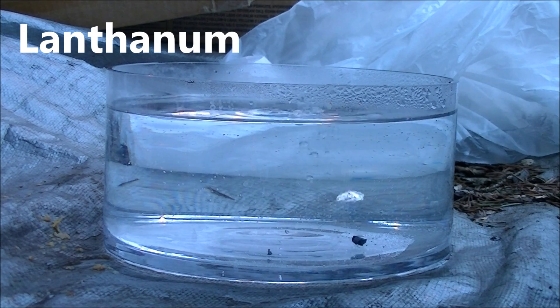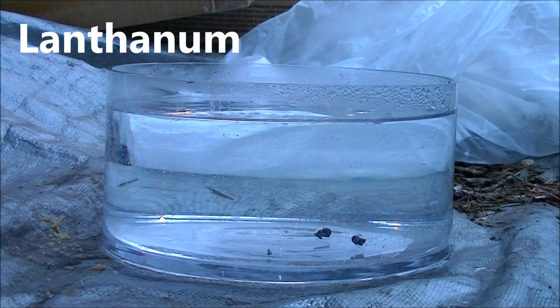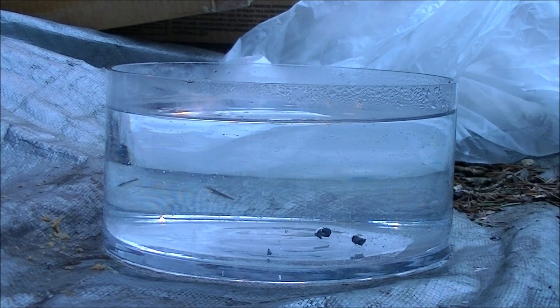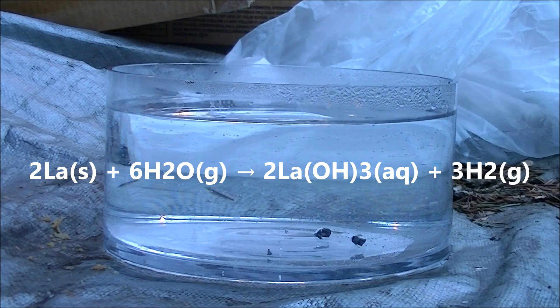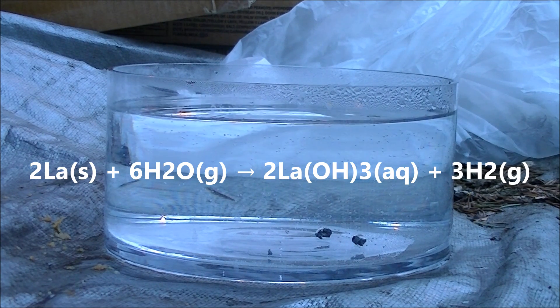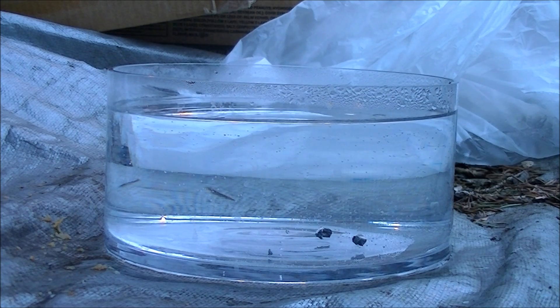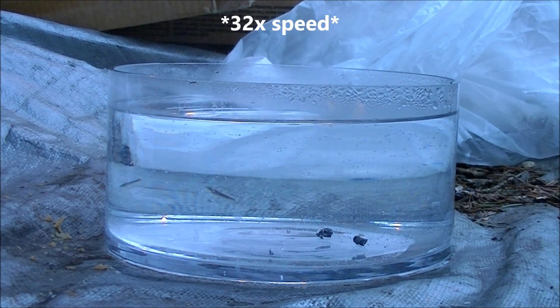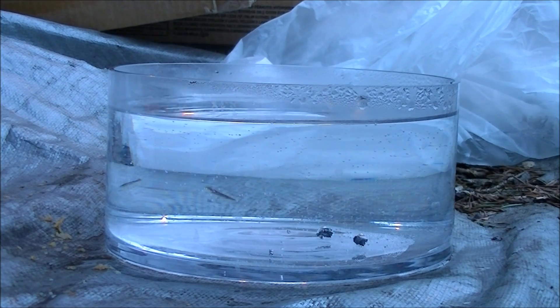And finally, here's lanthanum — the lanthanide most similar to the alkaline earth metals, and the one that some consider the true group 3 element. Lanthanum turned out to be the biggest disappointment. While I wasn't expecting much from the other four, I was expecting this one to be similar to an alkaline earth metal. Unfortunately, that was not the case.